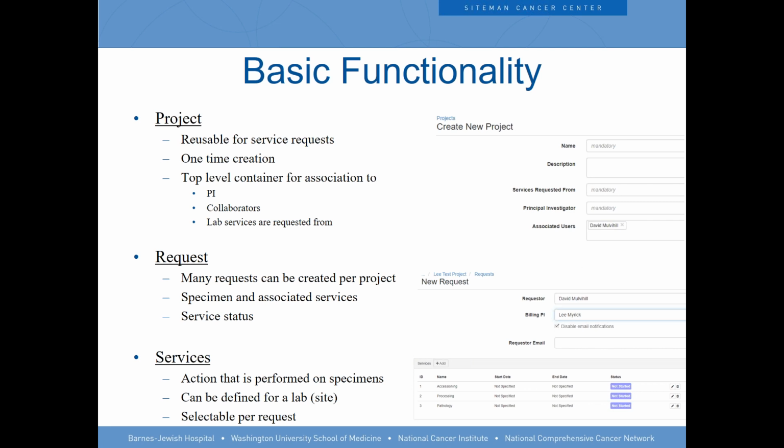Yeah, so Damien asks, is OpenSpecimen customized for each institution? Not really. Basically, we differentiate between what is customization and what is configuration. Configuration is where it's the same product, but you do different things. Customization is where you actually have to do code changes or programming to do something. So everything that you see right now in this demo or in general is all configuration. It's a single version of the product, just that it's configured differently for different institutes, as well as within an institute, it could be configured differently for different groups or different protocols.